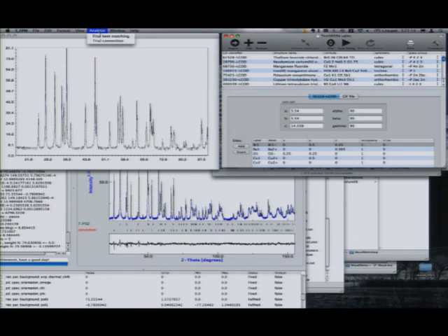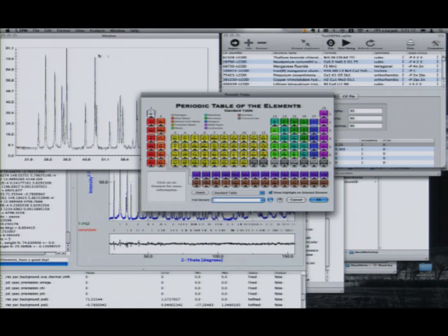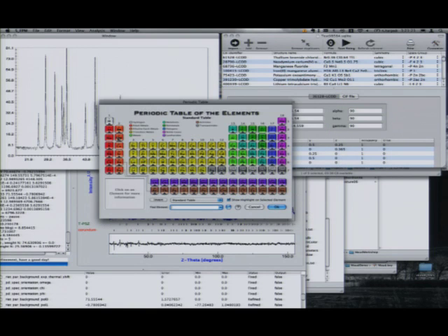But if I am able to restrict the composition, as for example I can do here, like say, okay, I know here we have only calcium, magnesium, if I remember well. Okay, no, first I have to invert, because I did select some. So let's say I have magnesium, calcium, zinc, aluminum, oxygen, and fluorine. I can even add some more. I don't put more atoms, otherwise I grow the number of phases too much, and I don't run in 1 minute, okay? So then I invert, because I just specify I don't want all the other atoms, okay?